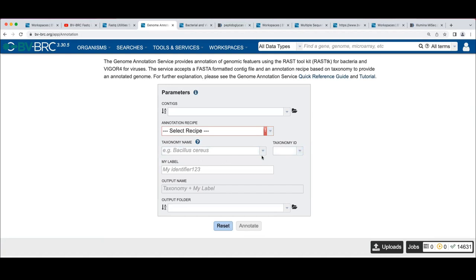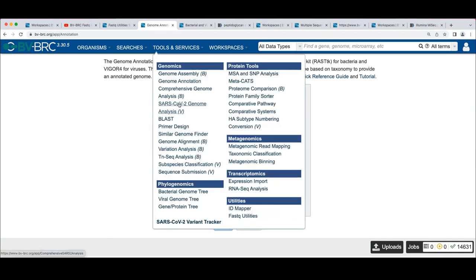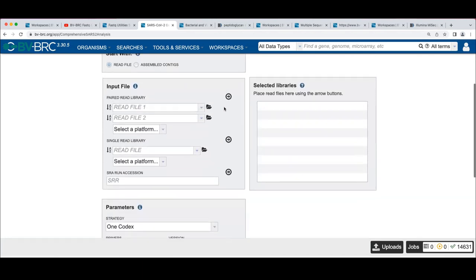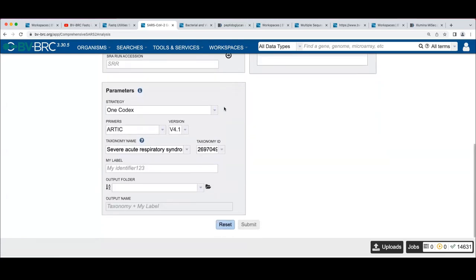You need to know your taxonomic name as closely as possible. Sometimes you won't know it, so you pick the taxonomy as close as you can — if it's Enterobacteriaceae, pick that; if it's Escherichia, pick that; if it's E. coli, pick that. We have some species-specific software that runs at the species level, so you want to catch that if you can. The SARS-CoV-2 analysis service can start from an assembled contig or reads, and you can choose your primer version.